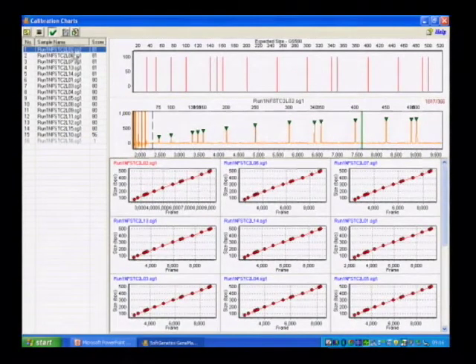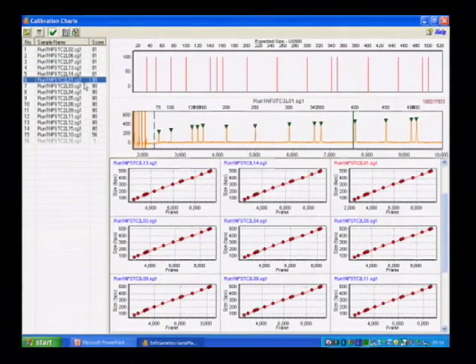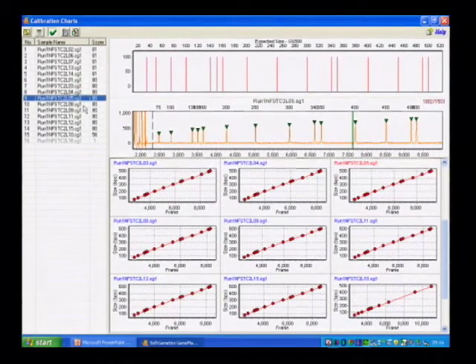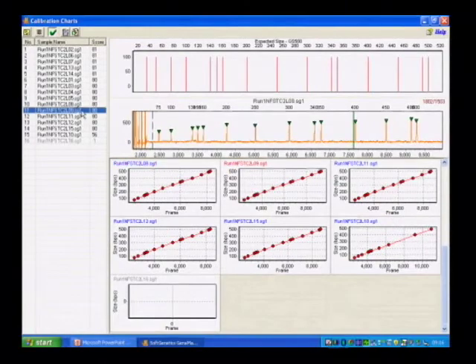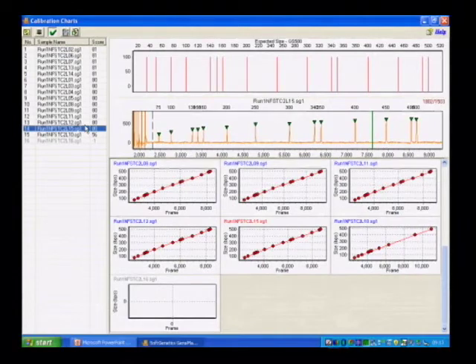For the other lanes, lane 1, or the sample number 1, all the sizing peaks have been identified. Sample 2, sample 3, 4, 5, 6, 7, 8. And 14. Okay, so what I'm going to do now is just go through the same format of looking at the 1 nanograms first.